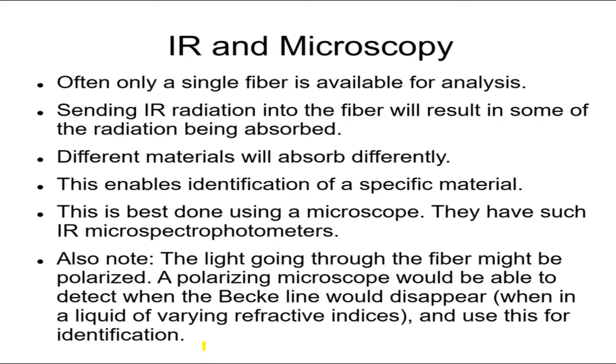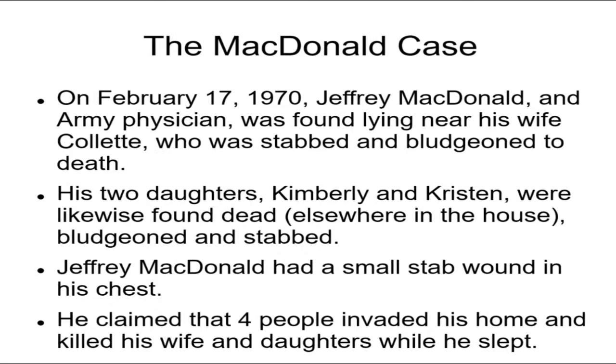So we'll know exactly what kind of thread, or more or less which kind of thread was used, and we can use it to compare not just the chemical, but also the refractive index or the way it rotates polarized light. Here's an interesting case.